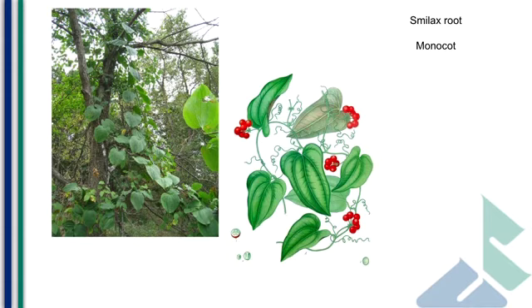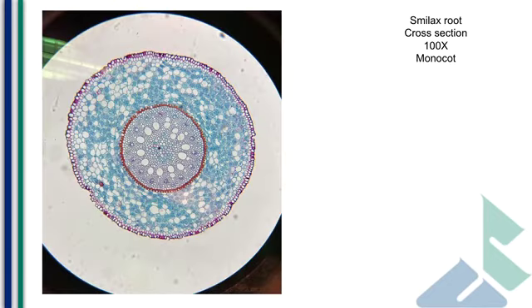As a monocot, its cellular structure in the root is going to be very distinct from our buttercup. Monocots, characterized by their parallel veins, you see how these things, even though they come out of one point, they do generally tend to run fairly parallel to one another, are really characterized by that lack of secondary growth, the lack of ability to get truly woody with annular rings. So under the microscope, this structure is going to look quite distinct from our dicot.